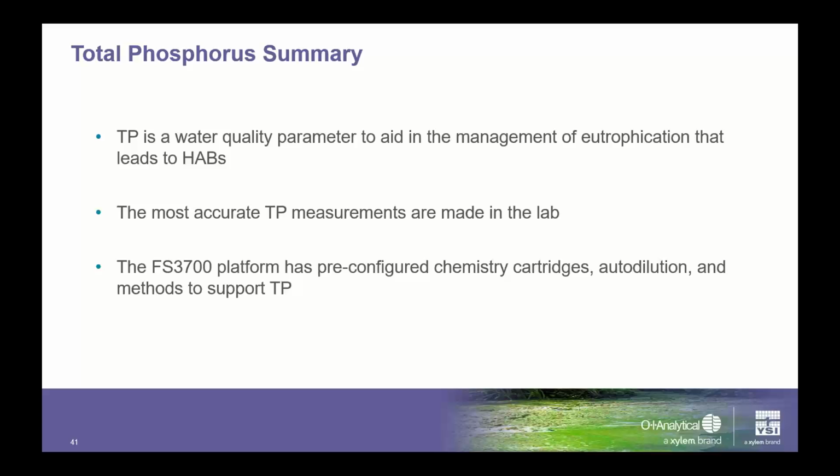When people use it for measuring the same things we're talking about here, you still have to back those measurements up in the laboratory. So it is a monitoring system. It does very, very good measurements, but people still collect samples and verify or validate those samples in the laboratory very often when they're using that system.